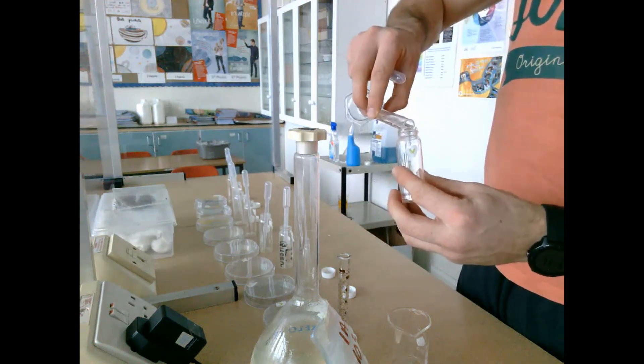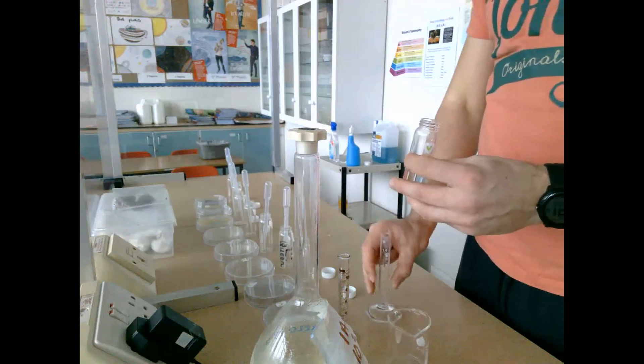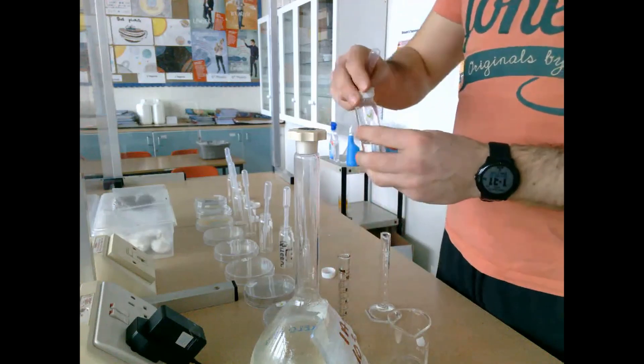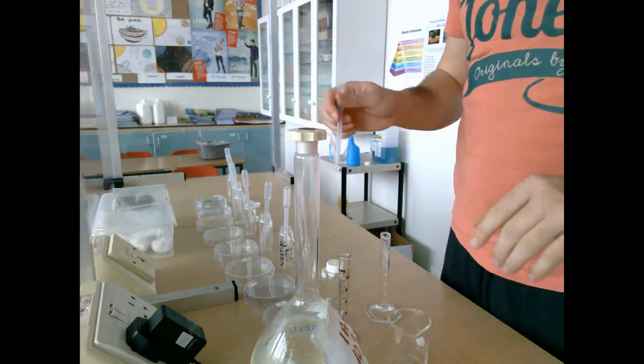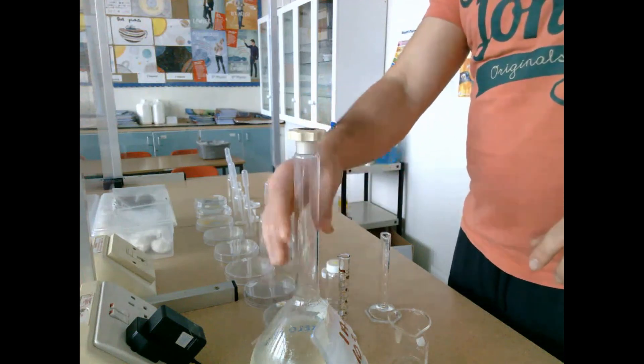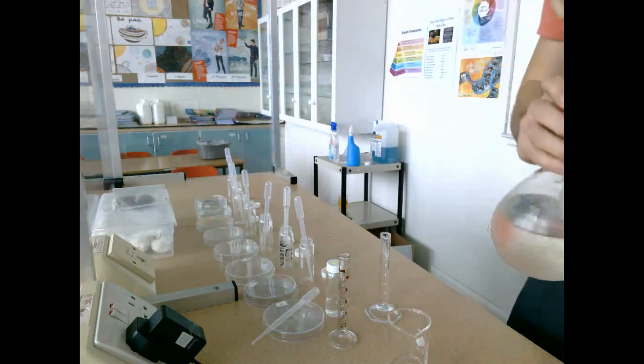Glass jar number one is going to act as the control. When this glass jar gets added to the petri dish with the radish seeds later on, it will show us growth comparison in comparison to all the IAA plates we're going to look at.